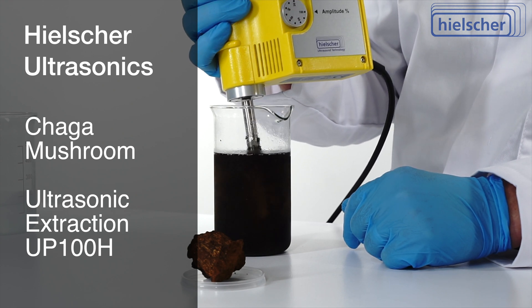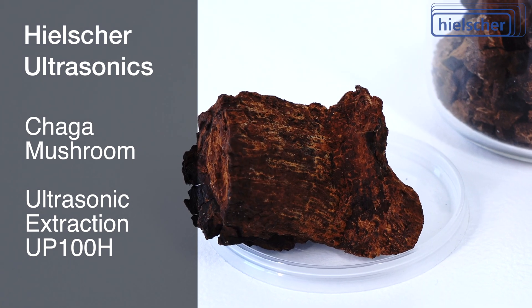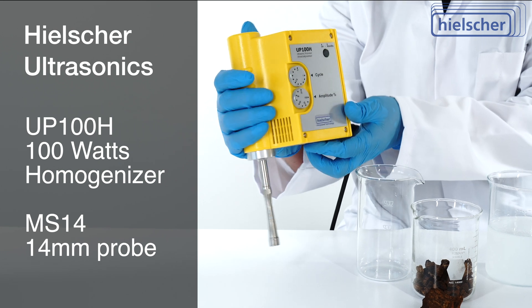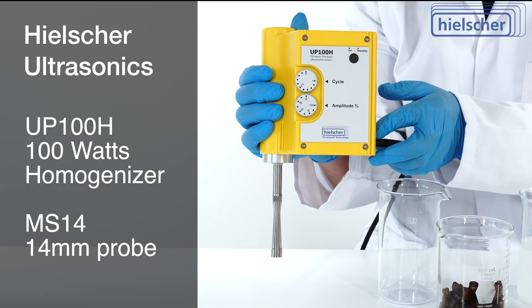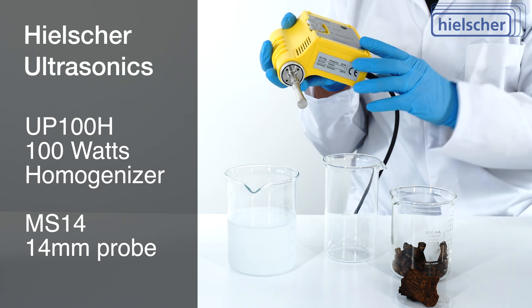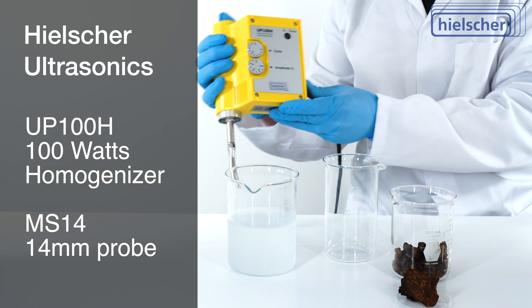Hi, in this video we demonstrate the ultrasonic cold water extraction of chaga mushrooms. The Hielscher UP100H is a 100-watt ultrasonic homogenizer. This 14 millimeter probe MS14 is very suitable for botanical extraction of small batches.